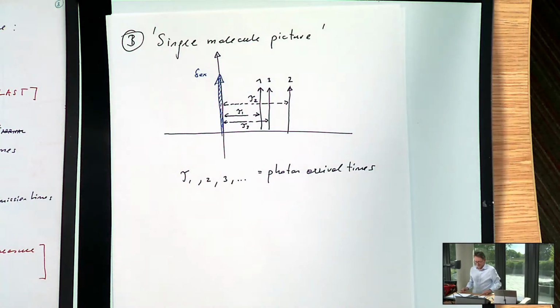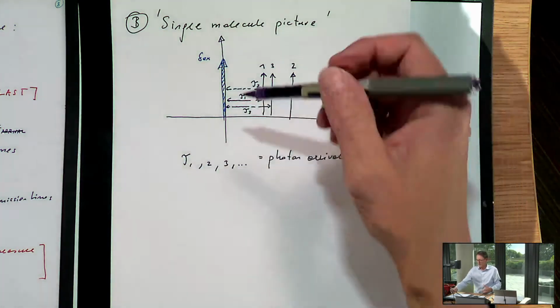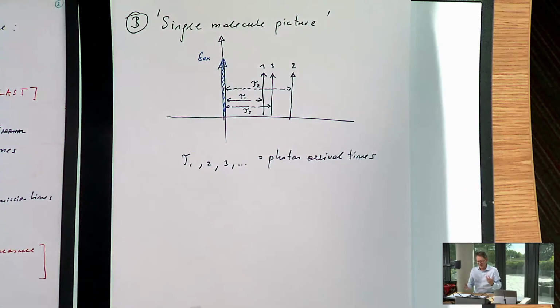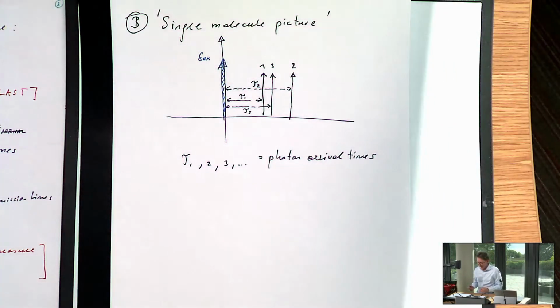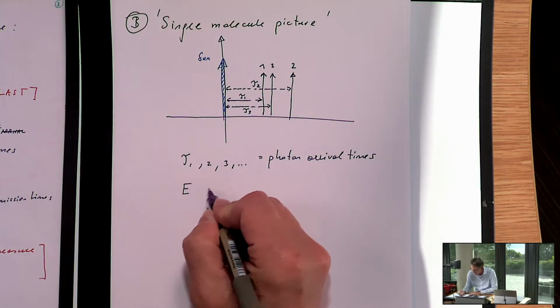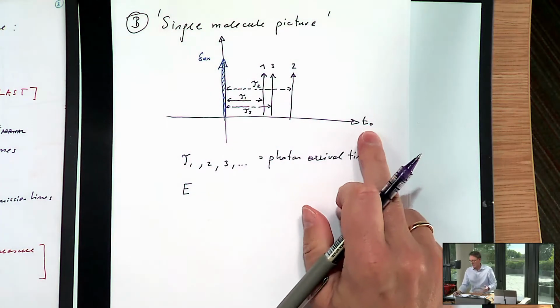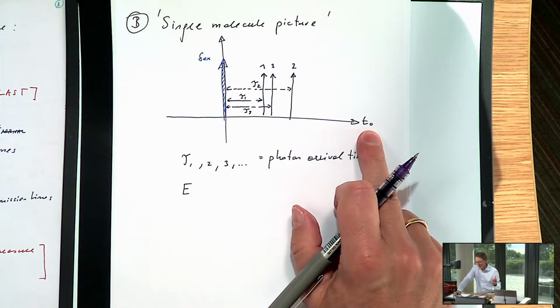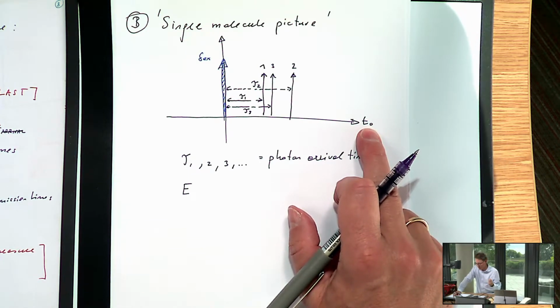And the point now is that, of course, there will be a distribution, a likelihood distribution. So if you could keep doing this many, many, many times, you'll get a distribution of photon arrival times. And the expectation value, so if I call this T0, so this just to specify that by this T0 I mean the instance at which the photon arrives, the photon arrival time.